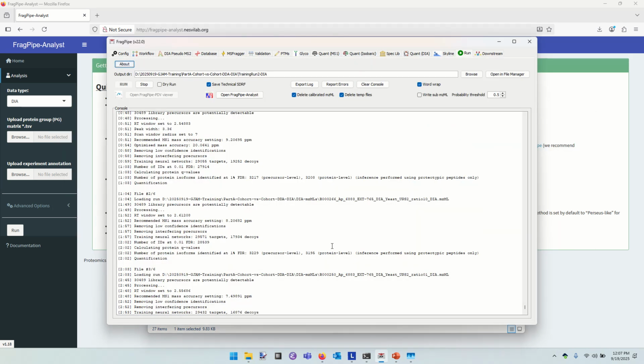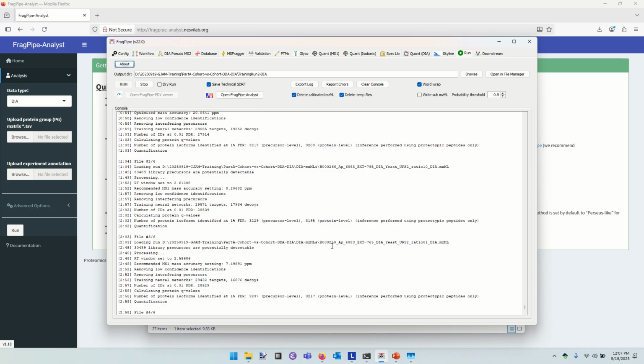As we come back to this, though, we see that we're closing in on the very end of the quantitation. Just a minute apiece. That is really nice. Yep. Fortunately, the DIA-NN library search is pretty fast. But if you did this whole thing in DIA-NN directly, not fast. Not fast at all in DIA-NN. On this laptop with my sturdy 8 cores, yes, it would be problematic. As you can see in my log file, I have MBR enabled here, which is because I put in the reanalyze flag.